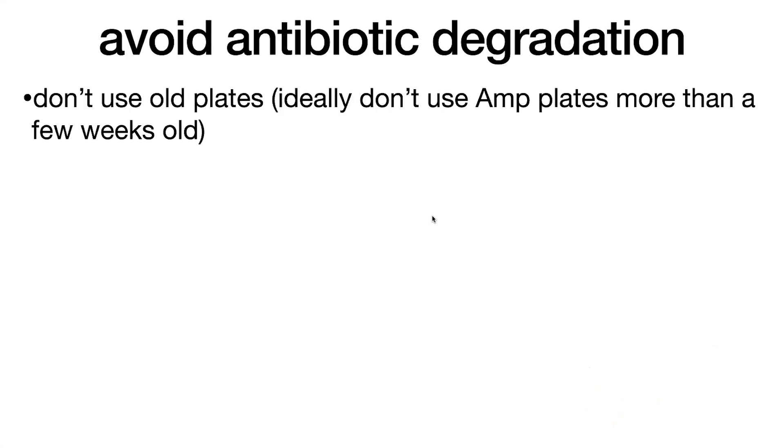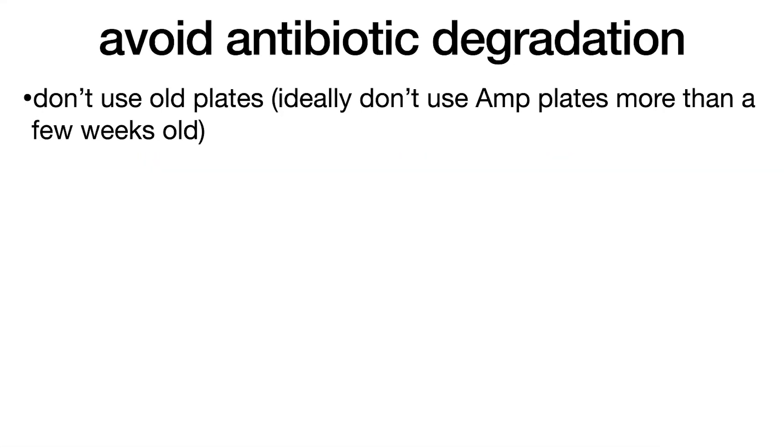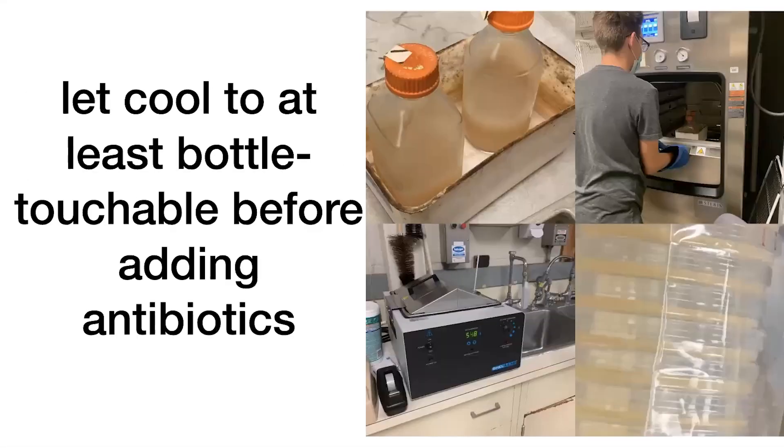Thankfully, there are easy ways to avoid satellite colonies. One is don't use old plates — ideally, don't use LB agar plates that are more than a few weeks old, although we often use ones that are much older. Also, don't add antibiotics to hot media. When you go to pour those plates, let the LB agar cool enough so you can touch it with your hands — at that point is when you want to add the antibiotic right before you pour them.